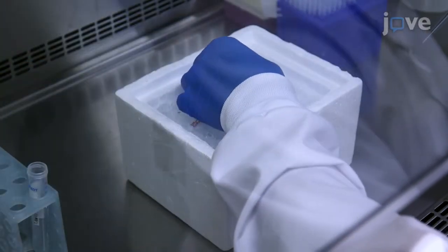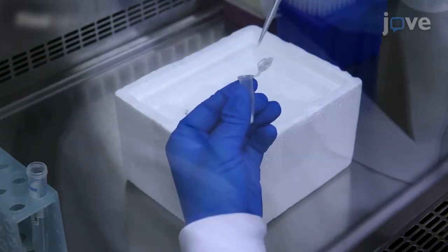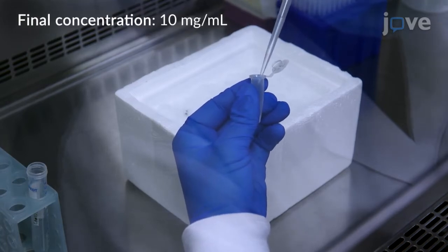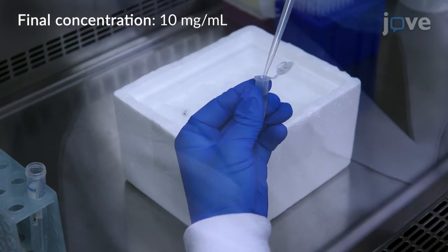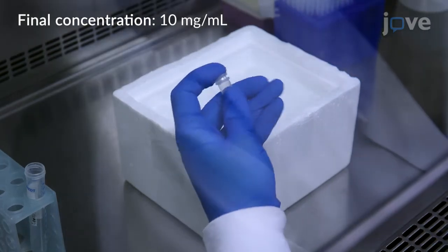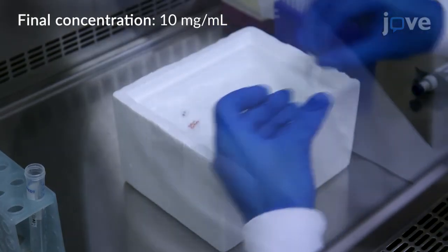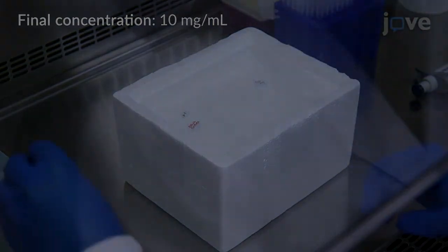Working in the cell culture hood, add 700 microliters of 0.9% saline solution to a 1.5 milliliter microcentrifuge tube containing 7 mg of powdered fibrinogen.